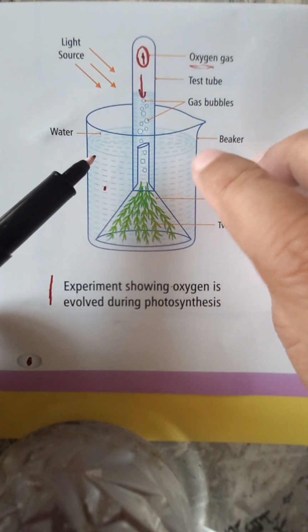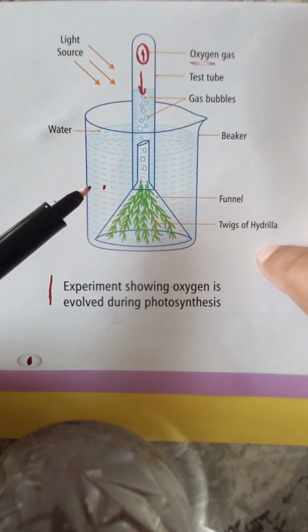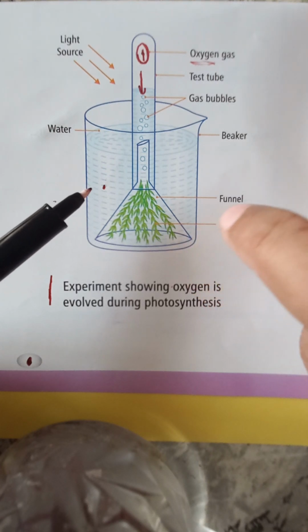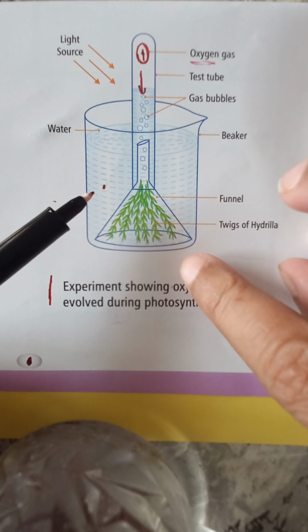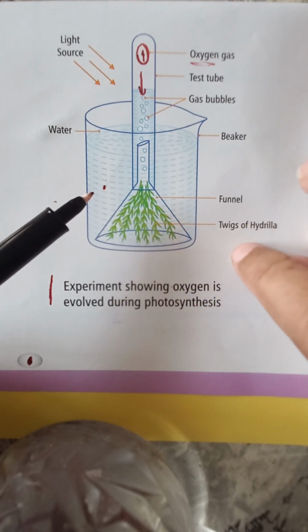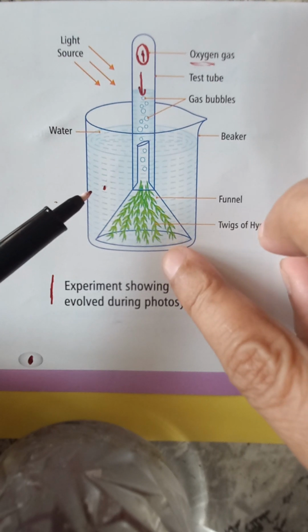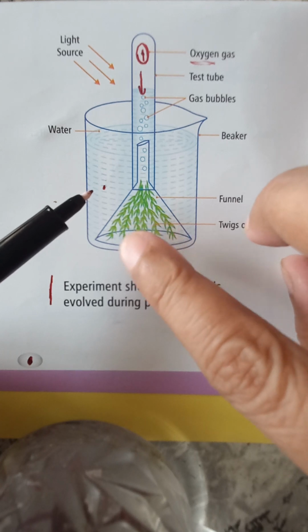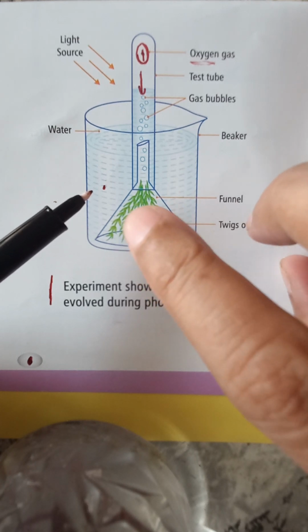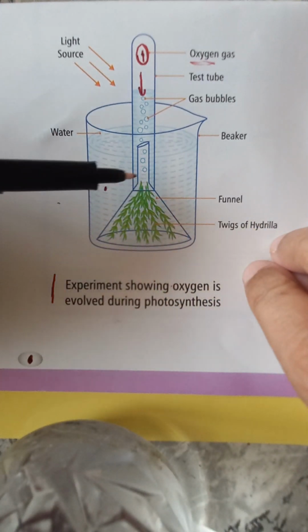You have to take a beaker and procure some twigs of hydrilla. Hydrilla is an aquatic plant and it has not got any stomata. It will use the carbon dioxide that is dissolved in the water. It is generally found in pond. So in an aquatic environment, the carbon dioxide that is dissolved is taken up by the leaves, and it uses the chlorophyll to produce oxygen and of course food for itself, that is glucose.